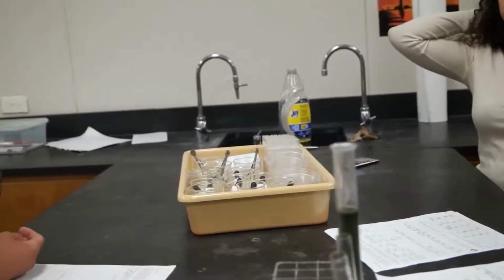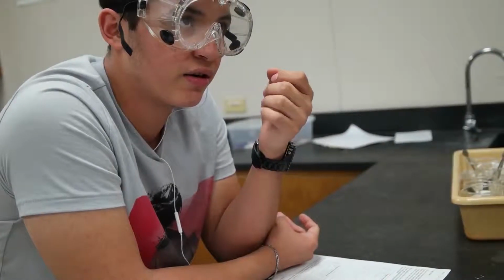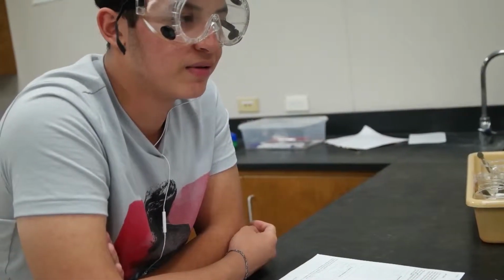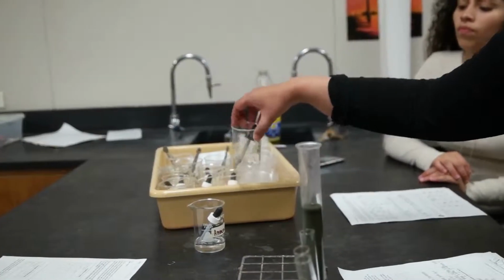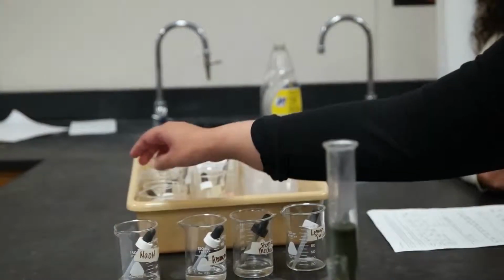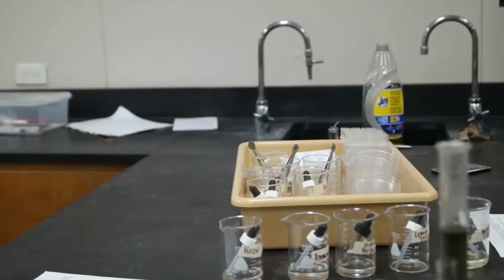What was your first task as a veterinary technician? Our first task was to determine whether the chemicals that the dog ingested were acidic or if they were base. Did you know anything about acids and bases before you started this? Not technically, but just that acid corrodes many things and bases just stays neutral. So the pet owners actually brought in certain chemical samples and we partitioned them into different features. What was your second task assigned to you by your boss? Well, we were assigned to determine with litmus paper whether or not the solutions were acids or bases.